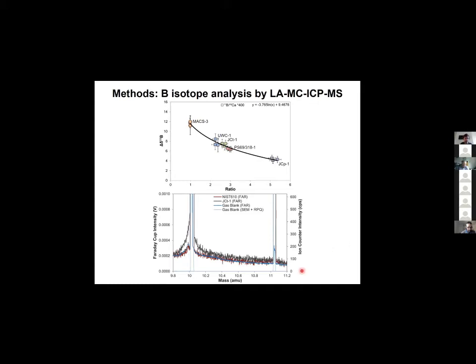The lower plot shows a mass scan across the boron isotope range. What's key here is that the 3 plots using the Faraday cup detectors are showing this raised and irregular baseline or background signal across the entire mass range. So this is implying that we do have some kind of interference. Now, the signal of these backgrounds is proportional to the calcium within the material being ablated.